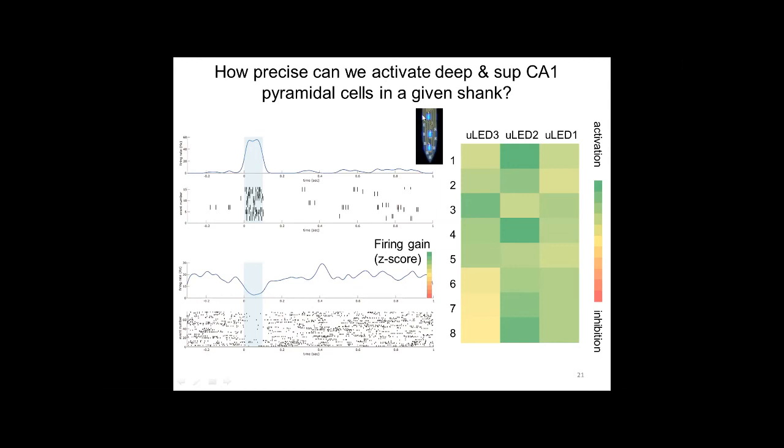firing, and as you can see, for LED number 3, things seem to be quite specific in these experiments. So we shed light, and we see responses in channels 1, 2, 3, 4, and 5, and then we see no clear differences. So that seems to be quite organized.